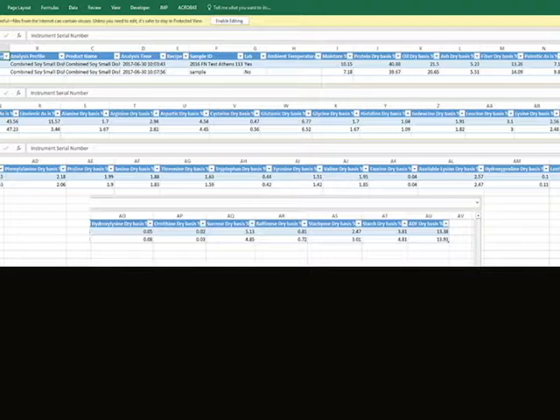These include the type of analysis, time of analysis, sample ID, moisture, protein, oil, ash, fiber, fatty acids, amino acids, sugars, and starch. Moisture should be from five to eight percent when using the NIR. This machine is a quick and efficient way to quantify many aspects of seed composition.